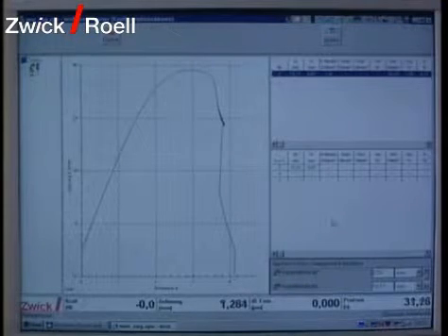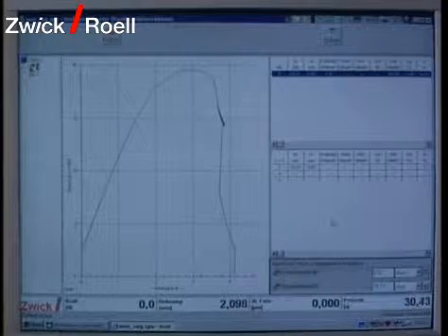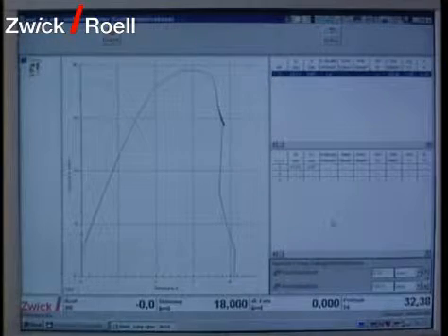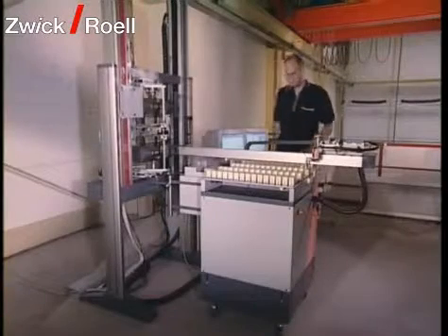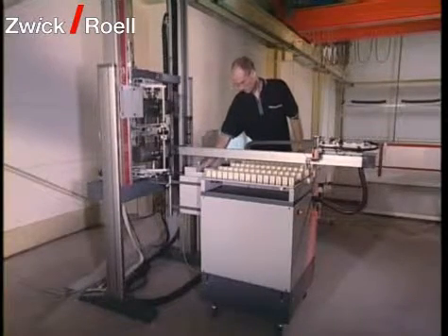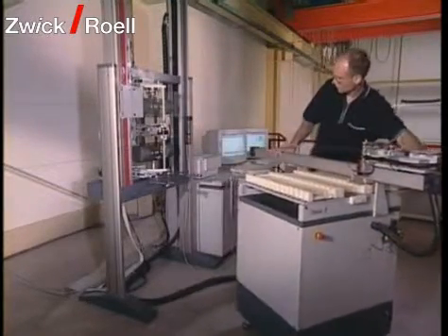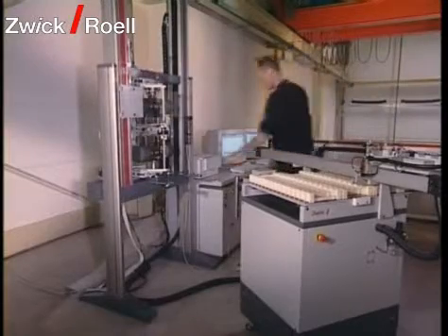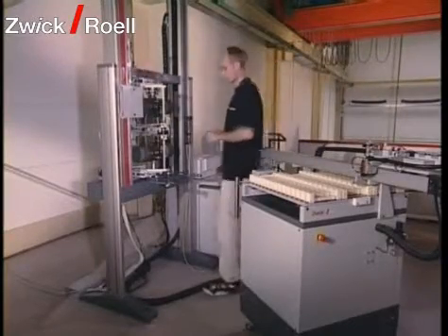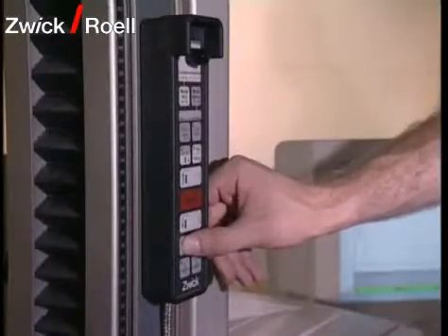The results are shown on the screen and printed out. Optionally, they can be transferred to a host computer. In addition to automatic testing, manual testing is possible. The specimen feeding system is then decoupled from the testing system, and the operator can control the sequence of the tensile test with the remote control.